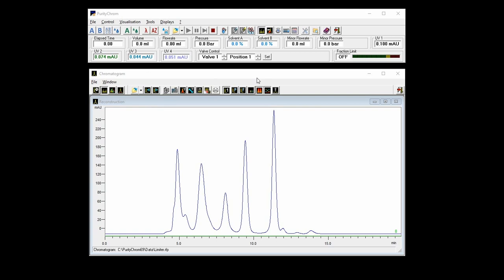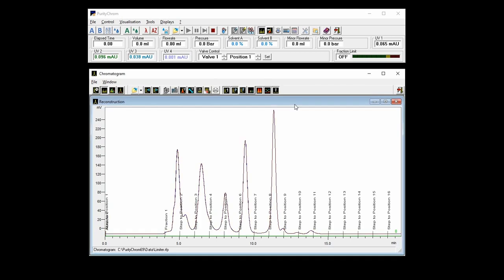The first possibility for fraction collection is using the fraction limiter. It is often used in standard FPSC runs and it means that upon setting the fraction collector into the fractionation mode, it will collect the same size fractions over the whole run.